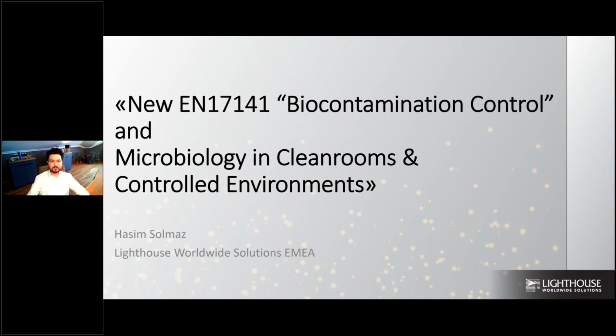So today we're going to cover the new EN17141 norm, which is about biocontamination control. We will be conducting on microbiology in clean rooms and controlled environments.